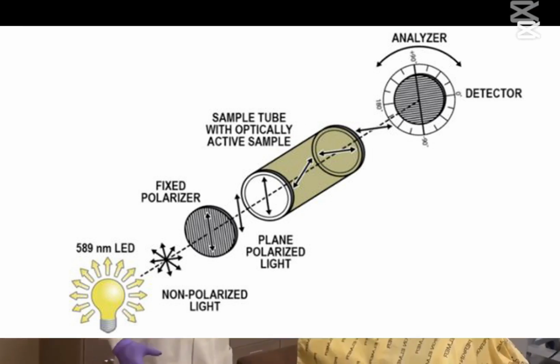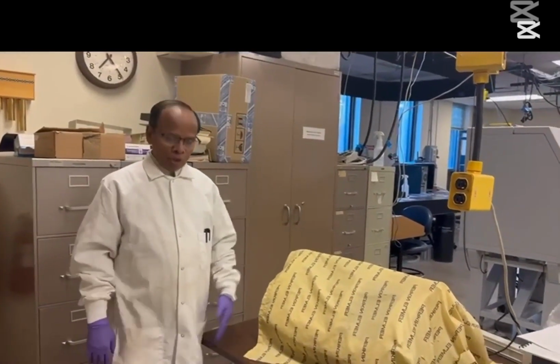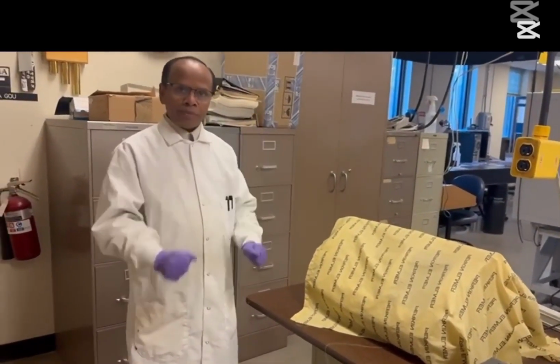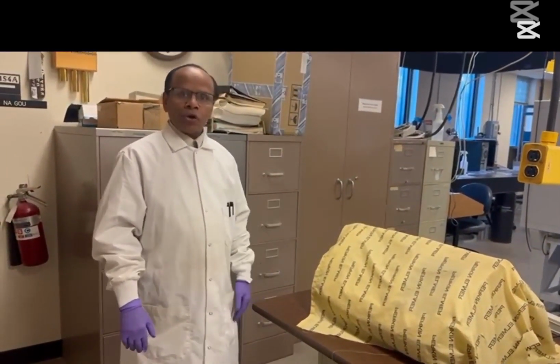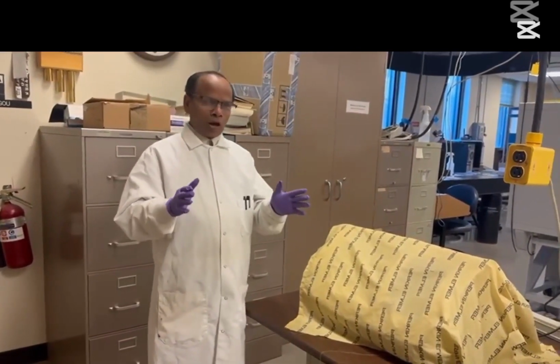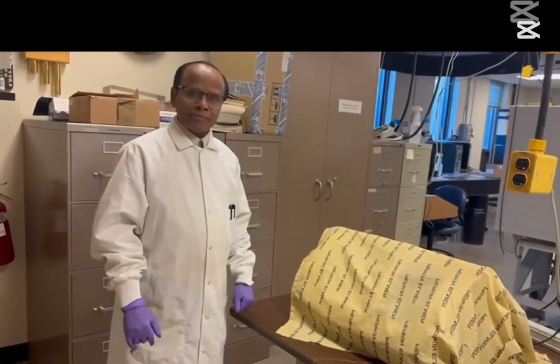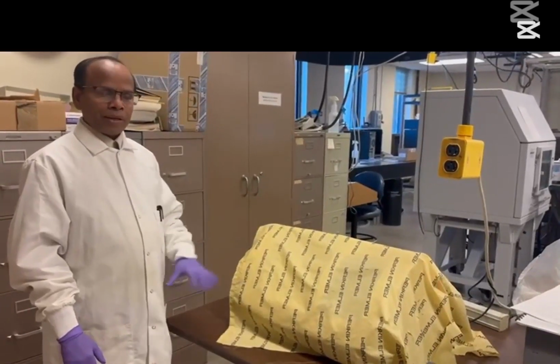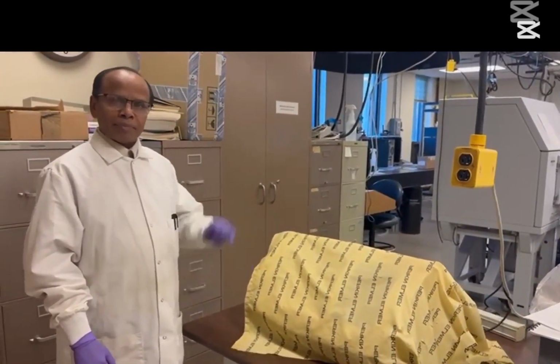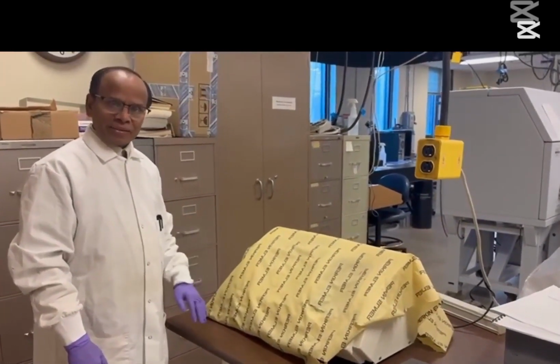the molecule. Before starting the experiment in the polarimeter, you should have proper PPE, especially gloves, because we are working with organic solvent. So today I'm going to talk in more detail. First, how to turn on the instrument, zero the instrument, then blank make to zero, then put some solution and measure. You should have an iLab reservation.